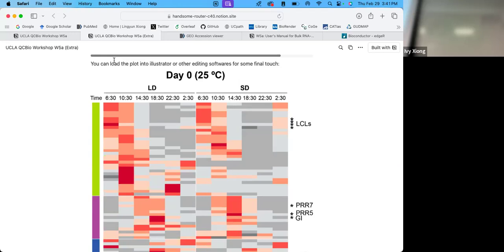Every time you open a new session, for example, I start my laptop and I open RStudio, I always start with loading packages. And then try to read files. Yeah, the very first thing. And I always give it as the first thing to do.